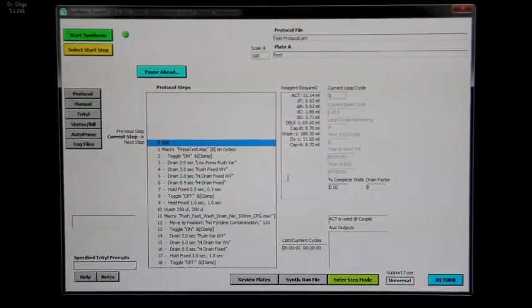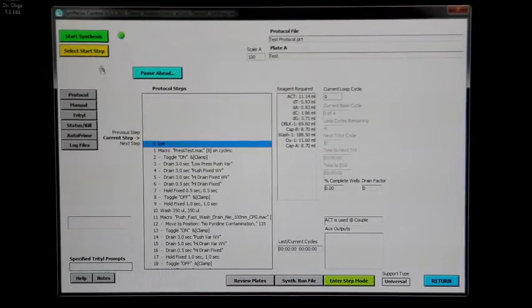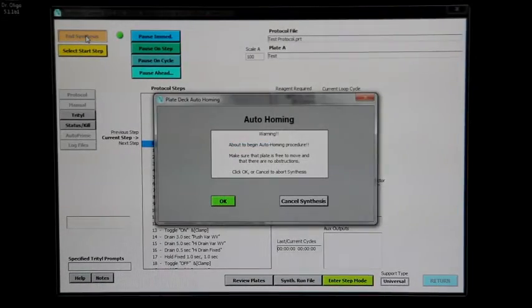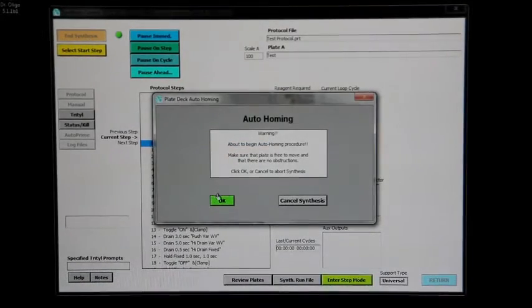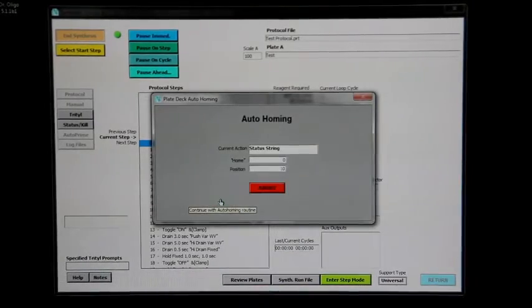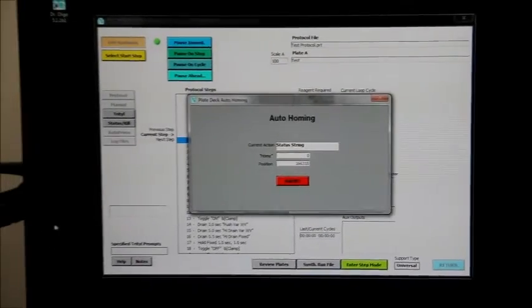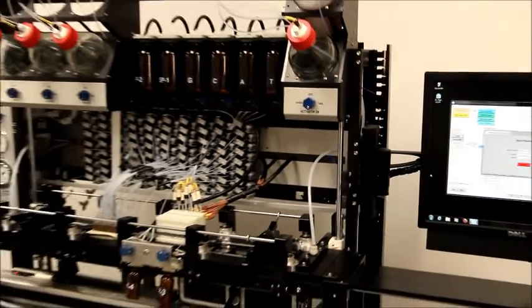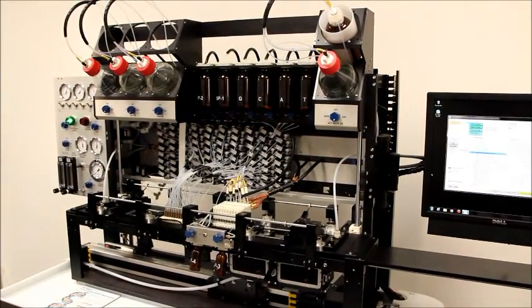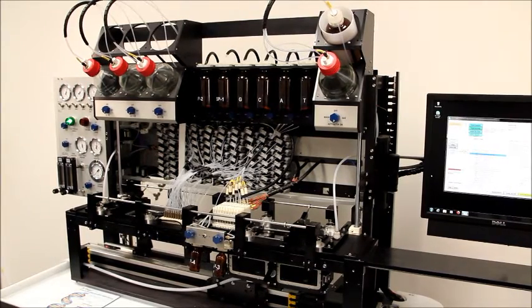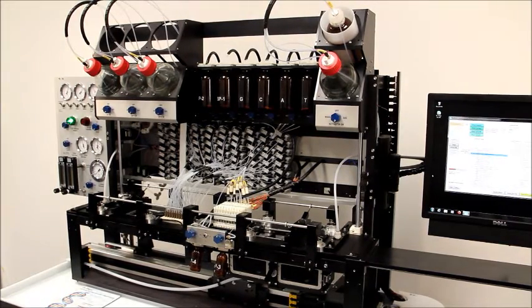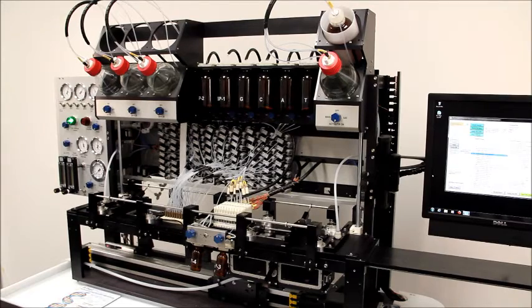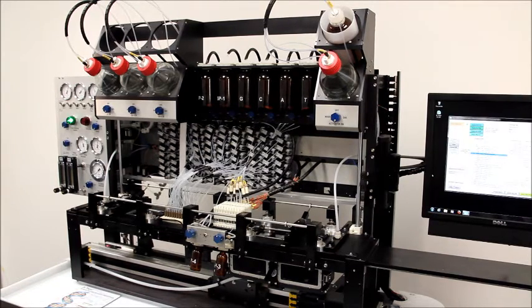To start the synthesis, click start synthesis. The instrument will home and then proceed with the synthesis reactions.